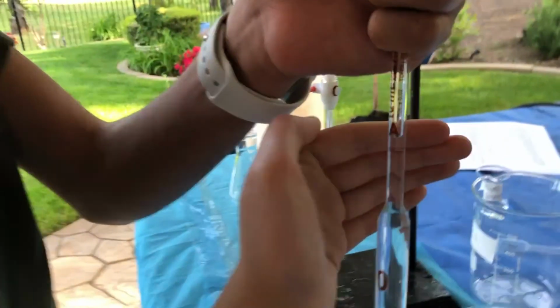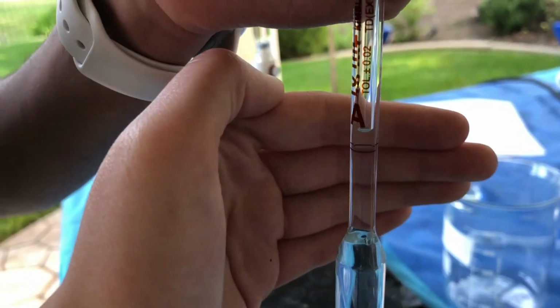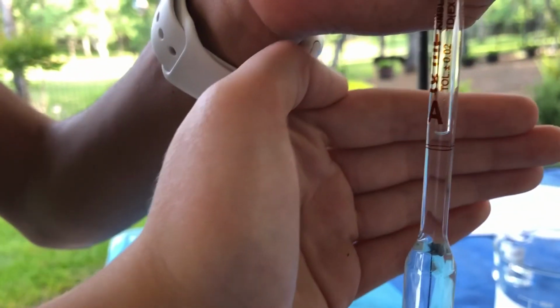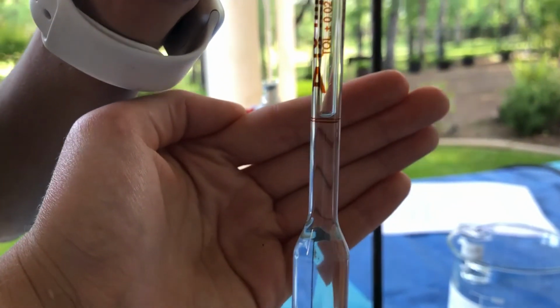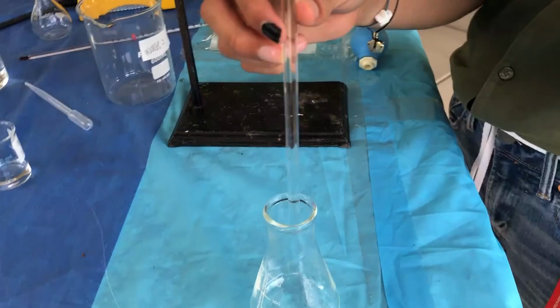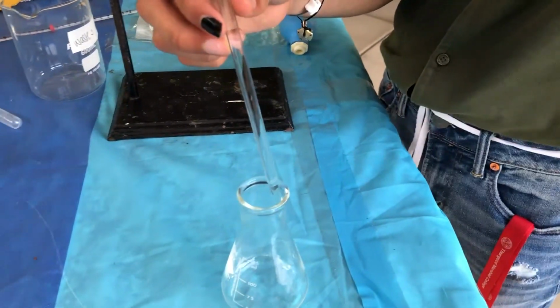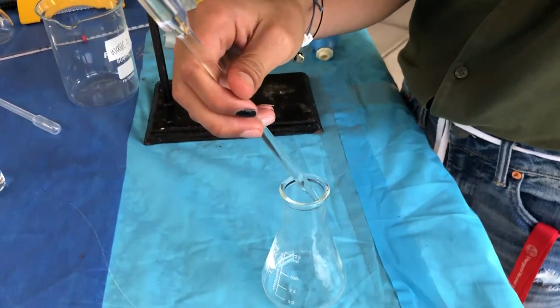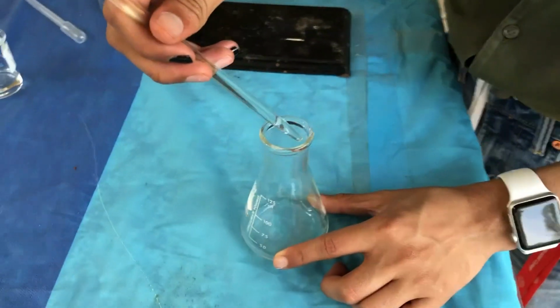Now he's going to get it down to this line. Almost there. Perfect. So now we transfer that into the Erlenmeyer flask.